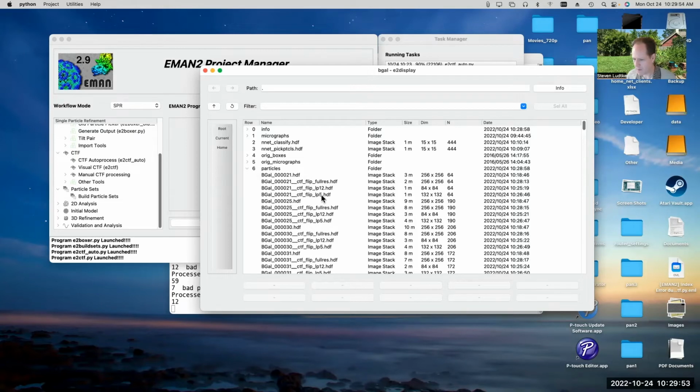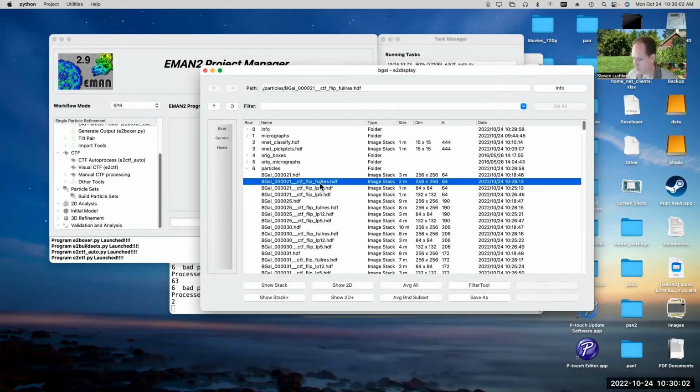It'll go ahead and make sets for you for each of these different types of particles, and then you can use them for whatever purposes you want. If you want, you can actually use the full resolution particles for everything. You don't have to use any of the filtered particles at all. It's just that some of the jobs that you run will take longer to run than they need to achieve whatever aims you're after.